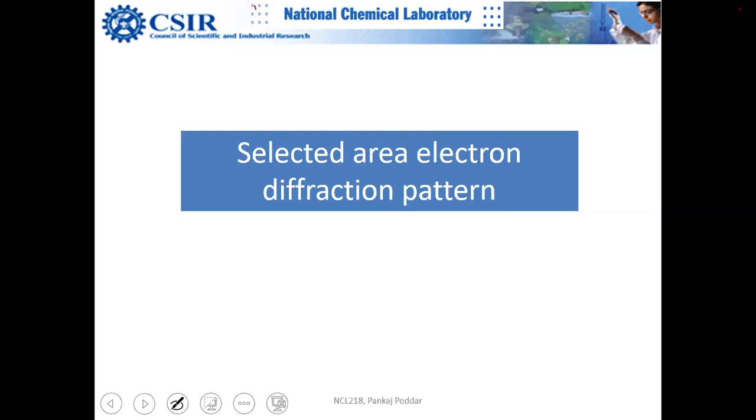Sir, by this technique, we also determine the allotropes of carbon. Fullerene C60 and graphene. You're right. But sir, it cannot determine diamond because pi interaction is absent. No. Diamond and graphite, you can easily distinguish using this technique. Distinguishing between diamond and graphite is very easy. But sir, you can do it even with Raman.